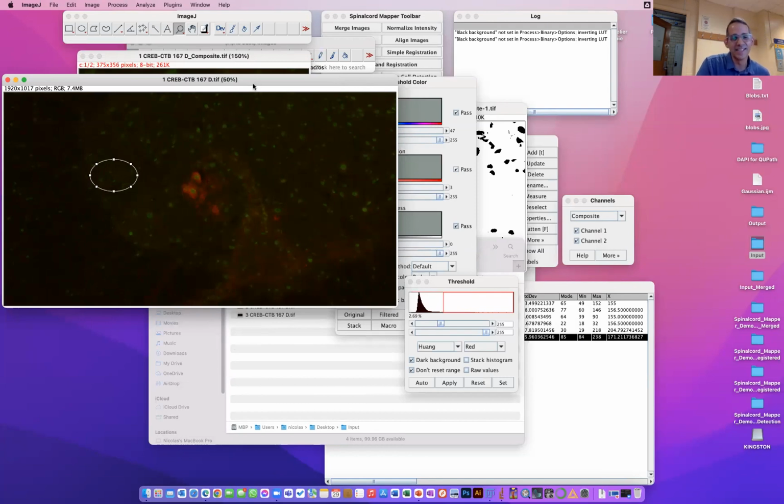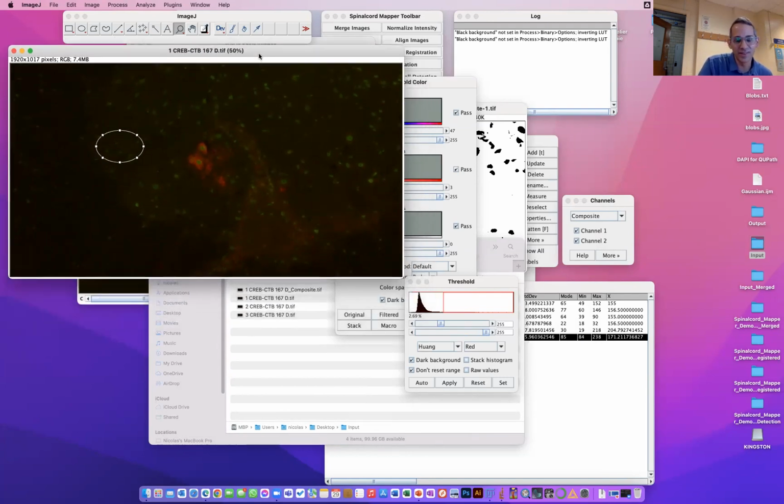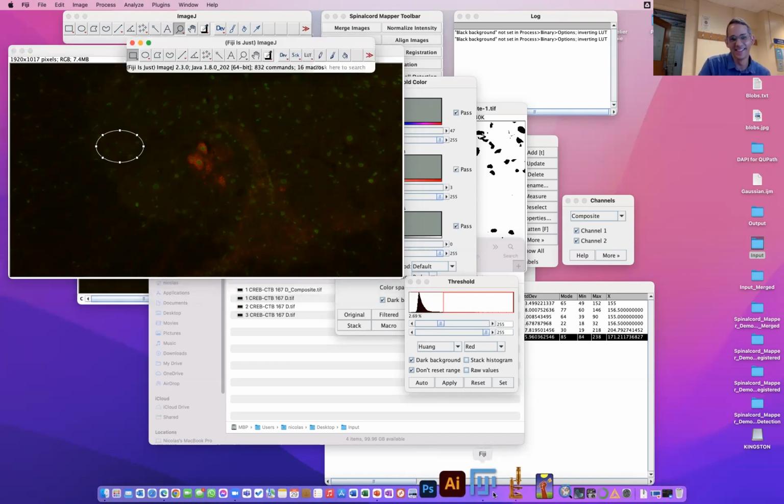According to Monique, and I think it's a good point, the best way would be to have a negative control of a slide that is not stained with a primary antibody, but only with the secondary antibody. Measure the fluorescence that is located there, which is really related to the background, and then subtract this value from the image. I did it, but it's very negative. Well, that's very possible.